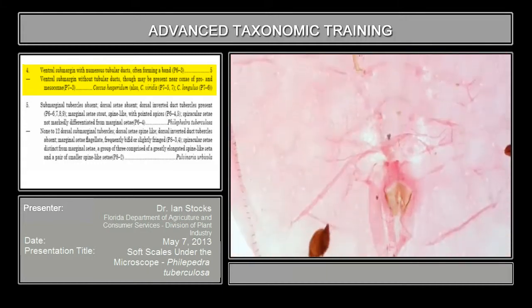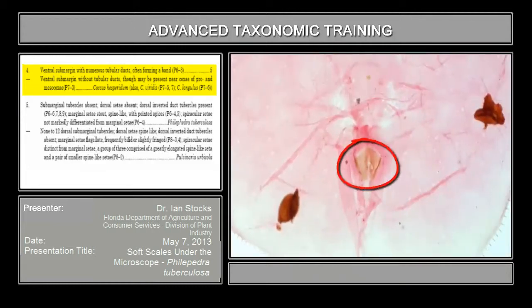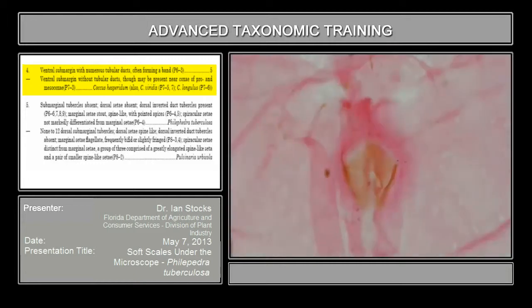Go down the body again towards the anal plates. Go up in magnification on the anal plates. It's really not a whole lot interesting in terms of key steps going off here, because you will have wound up in the part of the key where they're just going to be classified as quadrate, as opposed to some other more aberrant morphology. So this is just another example of the quadrate morphology here.